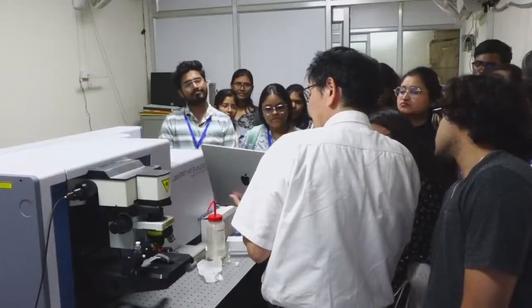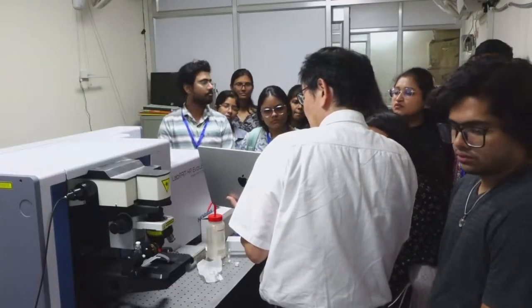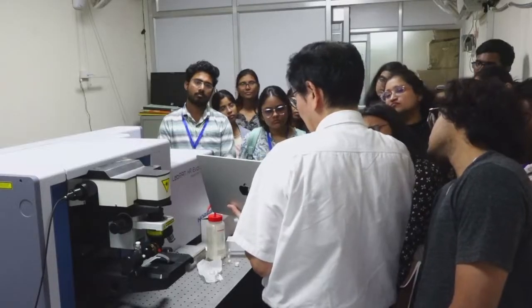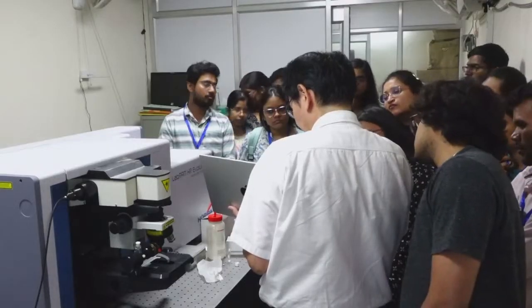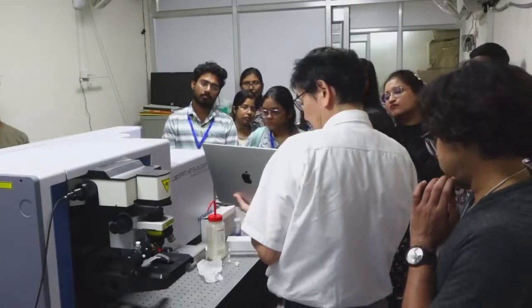Okay, it may be clearer. Peak here, peak here, peak here. So we can compare the IR and Raman spectra, and they give us different information. So it depends on the purpose.